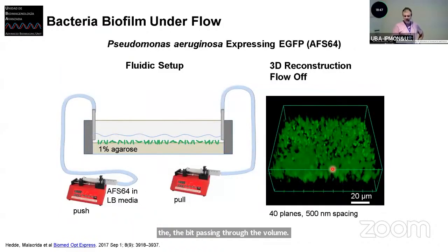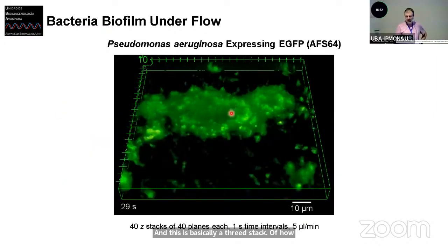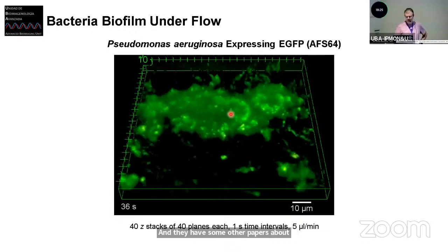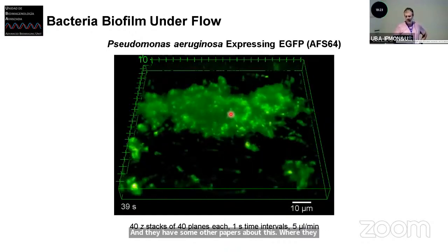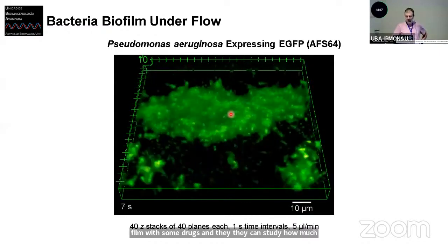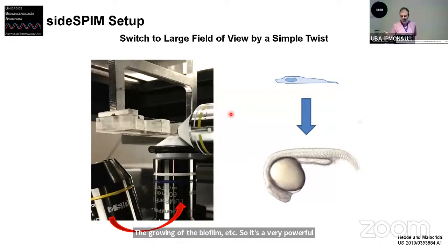But in some situations, they wanted to do biofilm studies, and this was just a test they were able to do to see the growth of biofilm. This is a 3D stack of how these bacteria are growing and generating biofilms. And they have some other papers about this, where they treat these biofilms with some drugs, and they can study how much this affects the growth of the biofilm, etc. So it's a very powerful technique for this kind of approach. The main reason why we wanted to do this is because we also wanted to combine it with other, more meso light sheet.